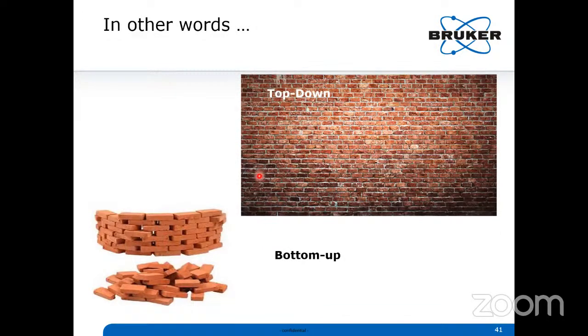If I ask you exactly, can you figure out in which position black color bricks are there, or in which position any brick is broken, or in which position any repair has happened, or can you count exactly how many bricks are here? No, that is difficult. I can simply say it's 150,000 Dalton. But if I ask exactly how many kinds of amino acids are there, or what modifications happen here, can you explain it? No, I can't. Why? Because figuring out small modifications like a 2 Dalton or 3 Dalton difference in a 150,000 Dalton protein is challenging.